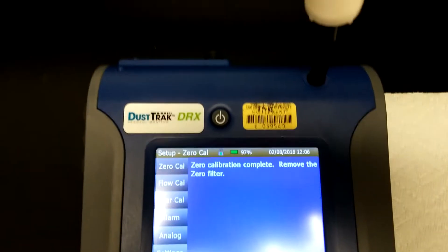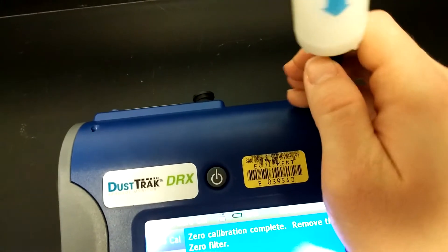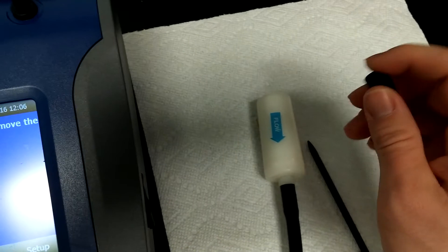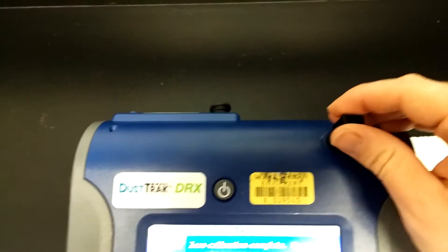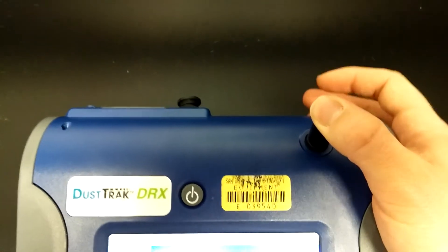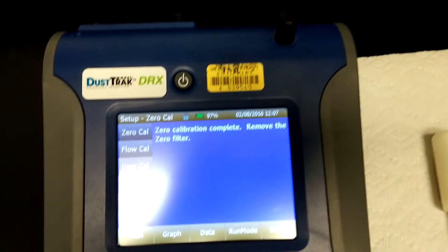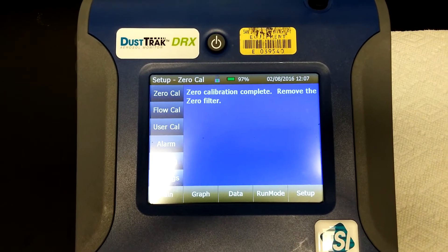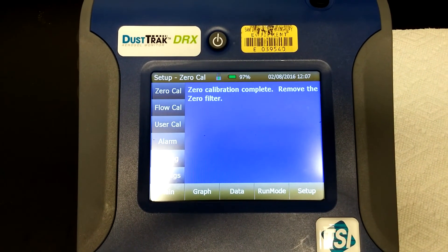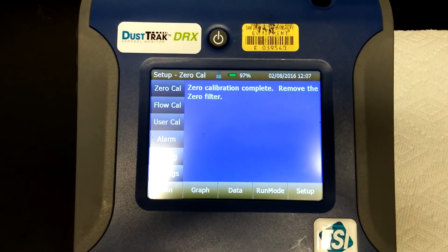When the calibration finishes, you can remove the zero filter and reattach the inlet cap. Or, you can attach a hose if you're going to be using a hose for sampling. After that, you're all done. You should zero calibrate the machine every day prior to sampling to ensure the validity of your data.